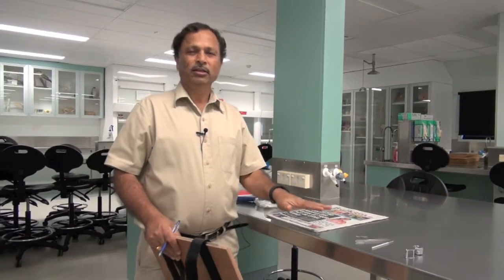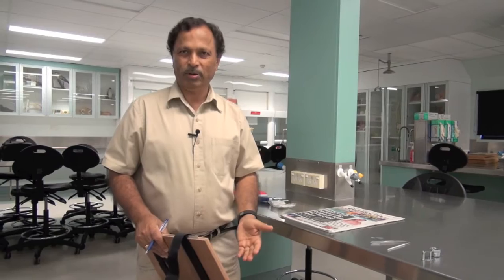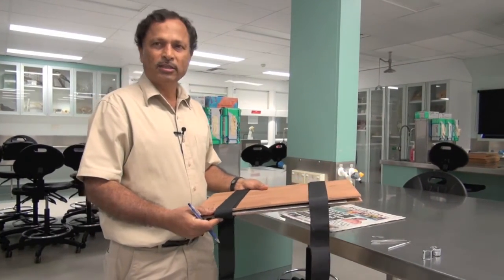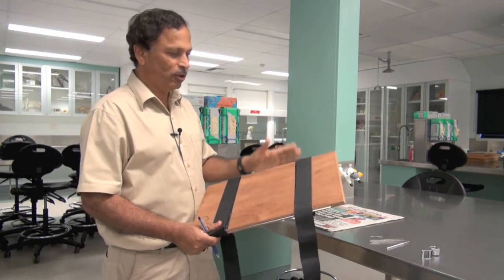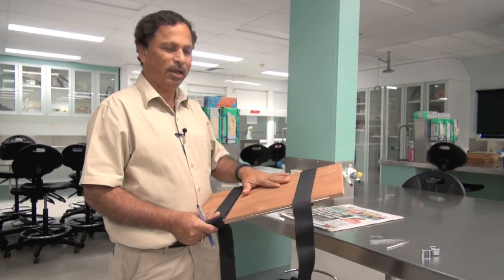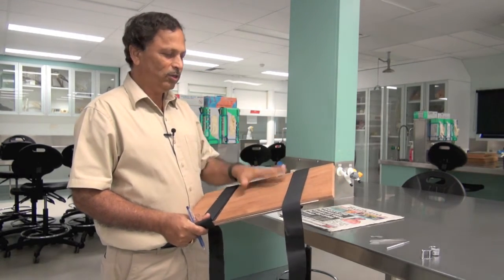In addition to these things, you also need a plant press. A plant press, something like this, is really ideal because it's not too heavy, it is rigid, and you can place your samples in here.